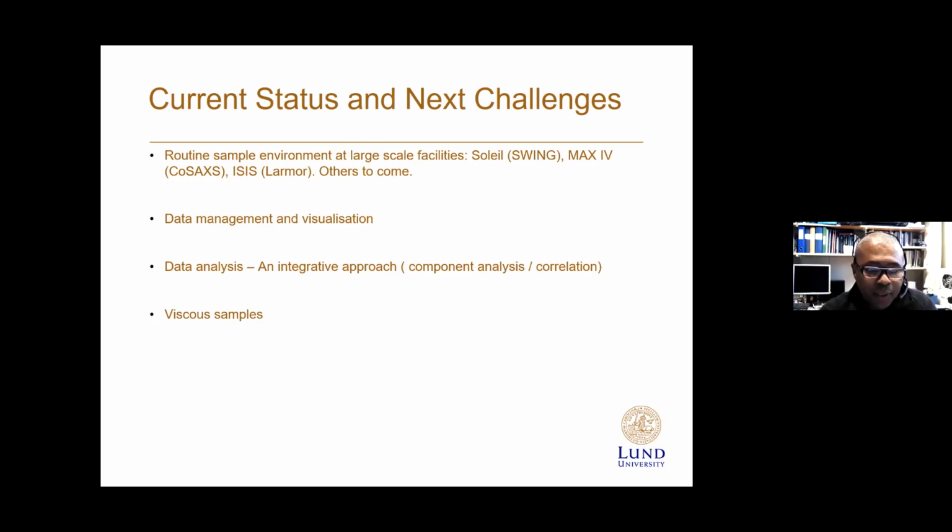And then, of course, there is interest in viscous samples, because at one point we cannot just work with low viscosity systems. There is the integration of other modalities. With the X-rays, we've been successful at integrating Raman to look at, for example, carbon nanodots and carbon dots, and then light scattering, but I'm not really a big fan of light scattering in that perspective, because it's extremely difficult to implement, which goes a little bit against the ethos that I've been trying to sell here, which is the ease and the portability of the system.